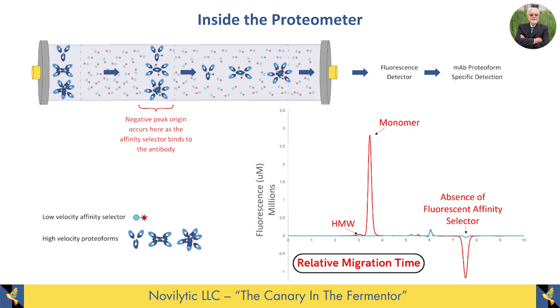And as we can see here, with this particular sample, it has a very small amount of dimer. And it's small enough that it's probably not a big problem. It's about 1 or 2% of the total product is dimer. And then you see over here, this one, there's almost none of it. So that's what goes on in the column, and that's what we mean by a molecular recognition analysis.